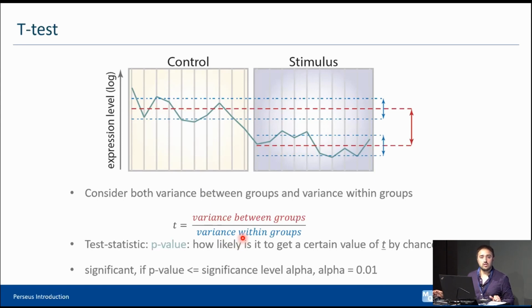But this is not the end of the story, right? Because you also have more effects that were probably not accounted for there. And this is exactly what the S0 term is about. You have more variance that is intrinsic from your experiment and the conditions you have, because the world is not perfect, right? There is always a little bit of variability, and then you just have a random variance here, right? And this is exactly what you're doing. You are just adding a term here to account for background variability of the conditions of the sample preparation, the device operation, all of these things.